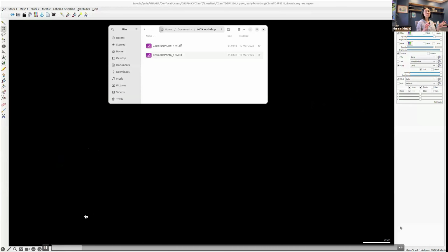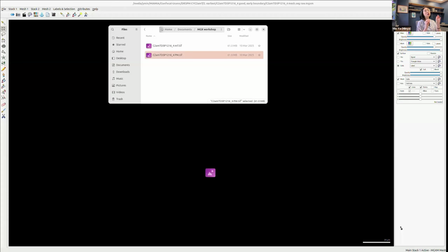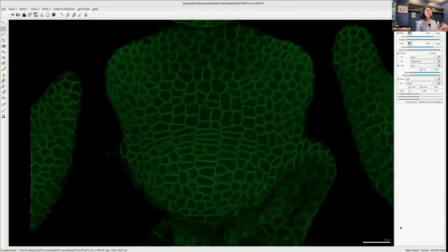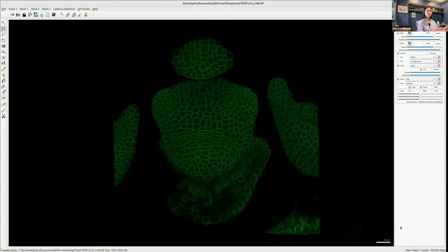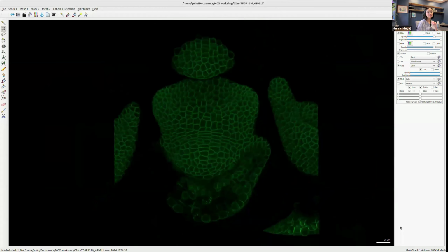So for my confocal, we collected 3 channels, the blue, the red, and the green. And here I separated the blue one and the green one, and you just drag the plasma membrane line directly inside. You can see this beautiful 3D constructed tissue already.